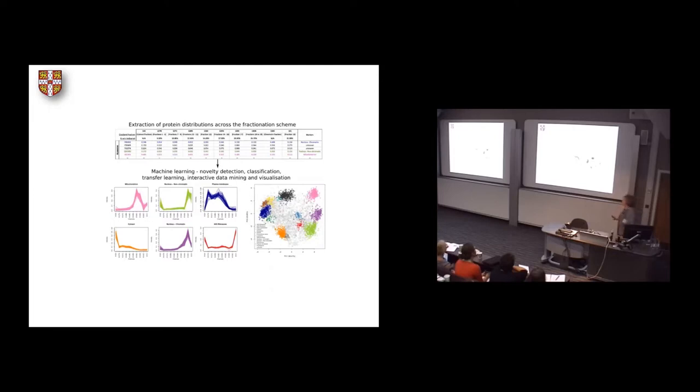So we've got very, very complicated data. We're now able to identify and give an address to around 10,000 proteins per experiment. And for each one of them, we want to have a look at its correlation profile and then how it matches the markers' correlation profiles. And ultimately, what we're going to do is to visualize our data using principal components analysis, which will cluster together proteins that are behaving in the same way. And we know what our clusters are because hopefully our clusters contain our protein markers.